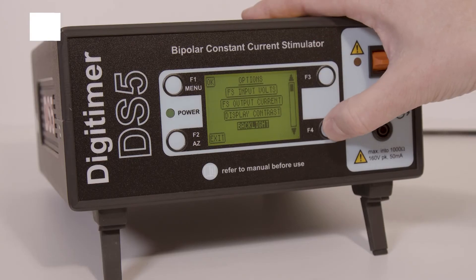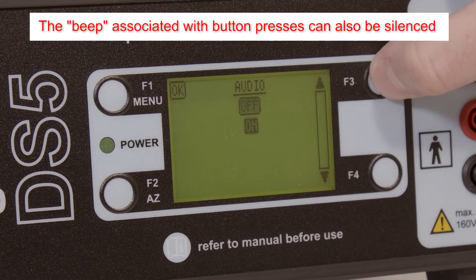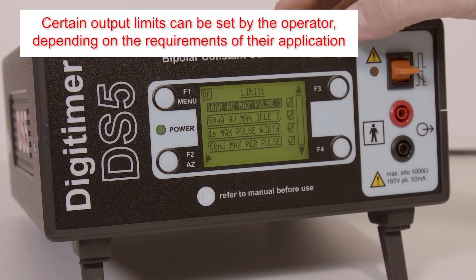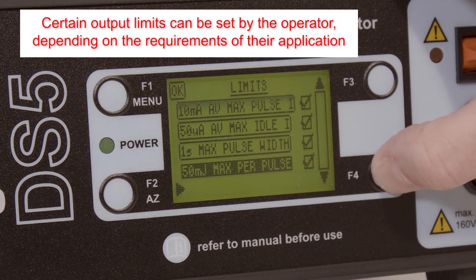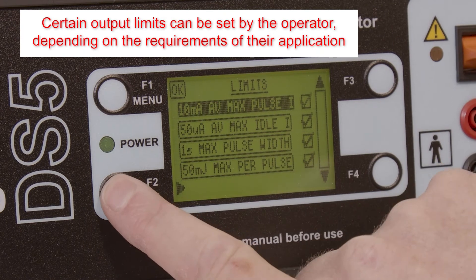The audio feedback beep when buttons are pressed can also be turned off within this menu. Additionally, the DS5 features certain output limits that can be disabled or enabled. These relate to the average high and low current levels, the pulse duration, and pulse energy.